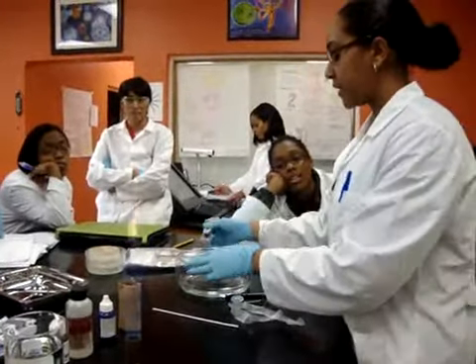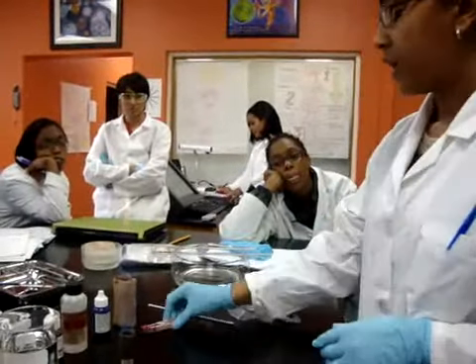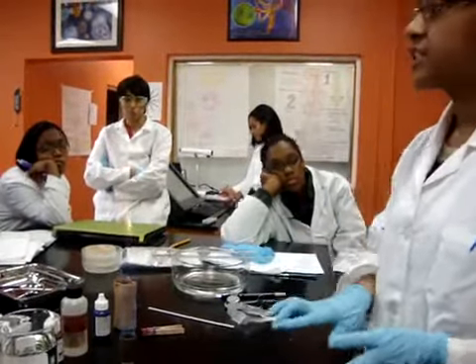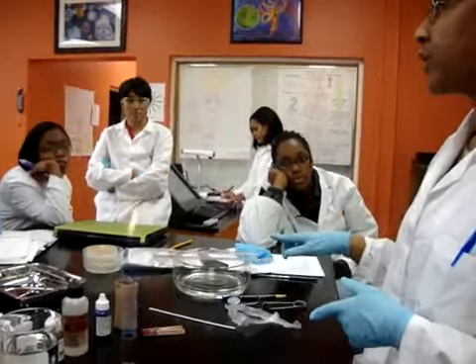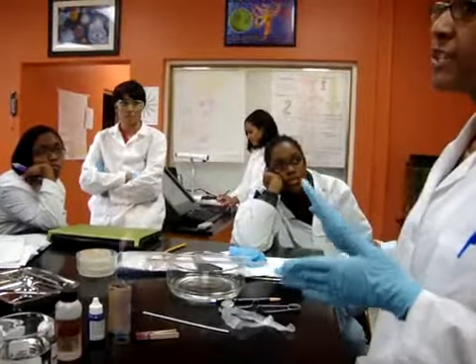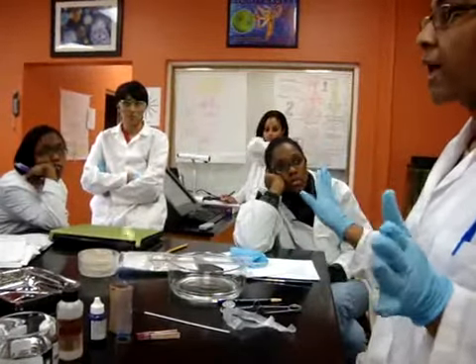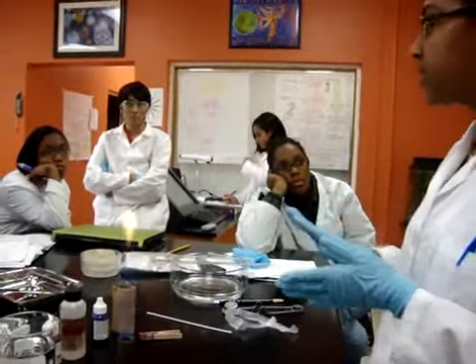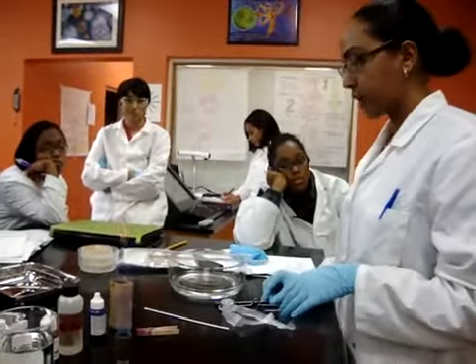Okay, so that is the first step. That's your smear preparation. Now, when you do your smear, I tell you to just touch the surface of that bacteria and not to scrape it up. If you have too much bacteria on your slide, you won't be able to see individual cells. It'll just look like one purple mass of dye. So you want to smear them really well so you spread out the cells, and when you look under the microscope, you actually see different bacteria cells.